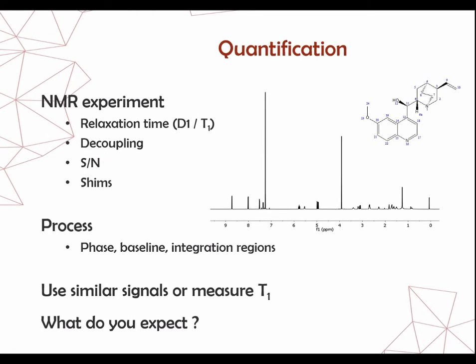So you said for normal measurements, like 10% precision, conditions close to routine are sufficient. So in terms of parameters, when I'm programming my proton NMR, what do I need to change? Do I need to change the number of scans, or what can I simply change to be more precise?